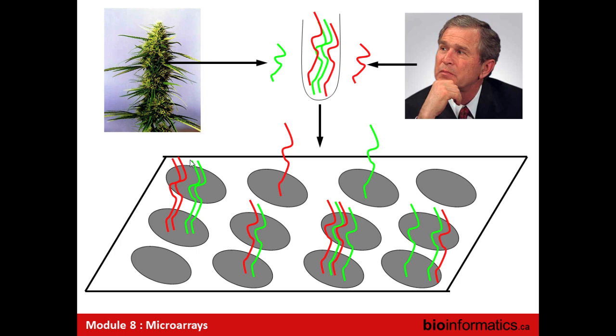So I don't know how many cotton research labs there are in the world, but let's pretend that there's 100, and across them they're going to be doing 100 arrays a year. That's 10,000. That's about the size of a typical single print run from any of the major array producers. So that means that all the labs have to coordinate to be able to say, yes, there is enough stuff for us to be able to make it worth your while to print and create an array. So it's very difficult to get traction and good financial characteristics around that. So I think that's a big part of the problem.